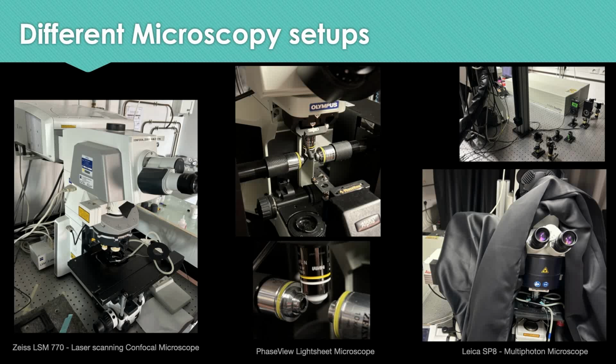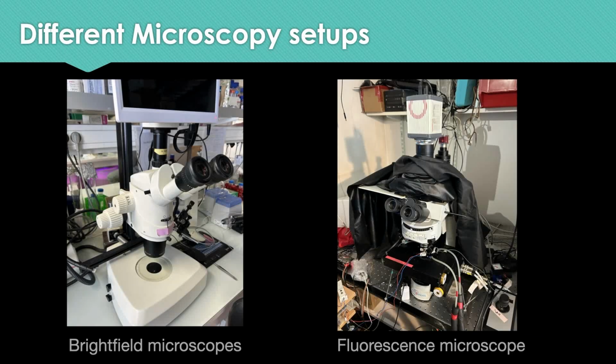One of the most standard forms of microscopy used in labs is bright field microscopy. It is quite simple, with the illumination of the sample with light and using a small lens to observe the specimen more closely. Its simplicity and cost-effective methodology makes it quite frequently used in labs to observe the sample.